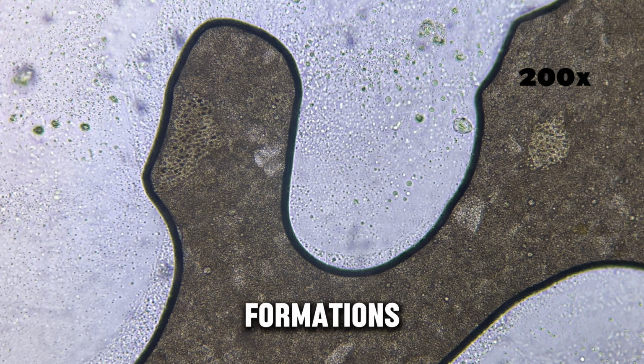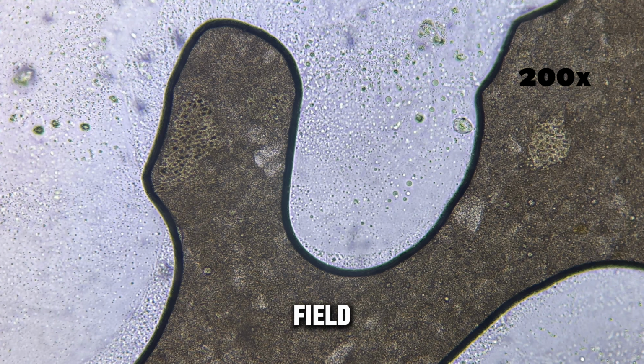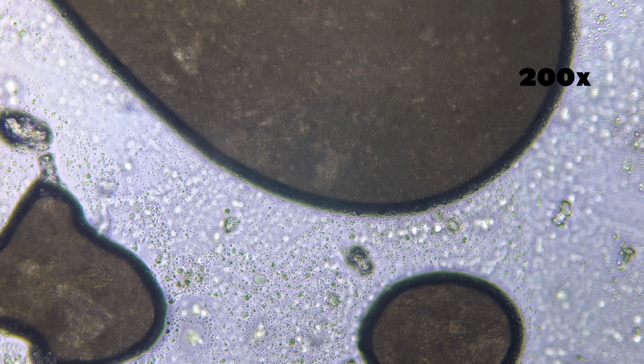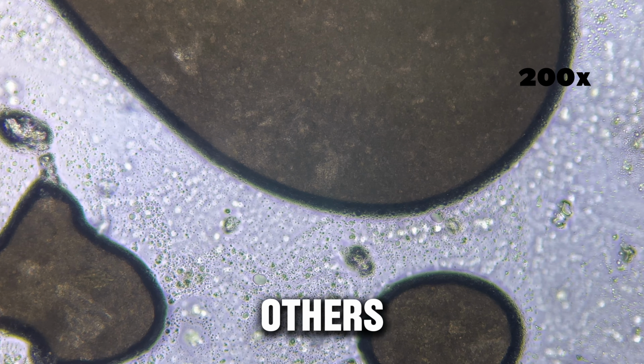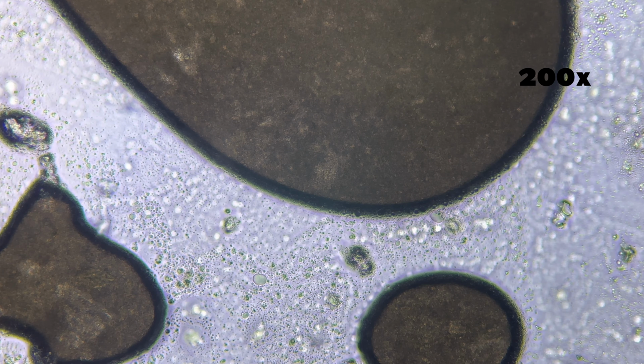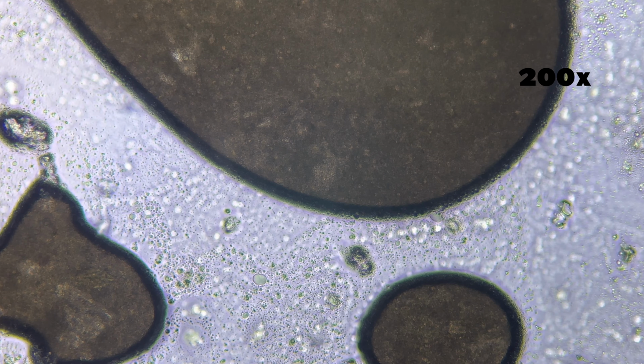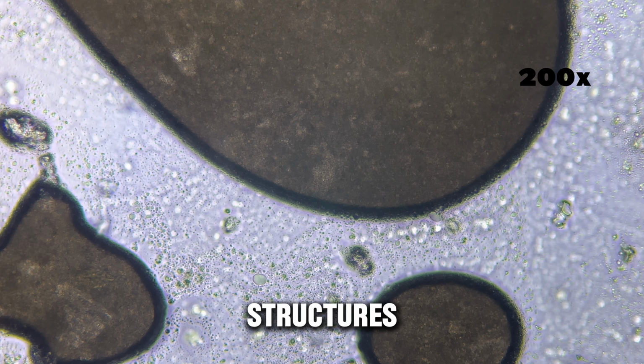Small rounded formations become clearly visible throughout the field of view. They vary in size and appear suspended within the surrounding material. Some cluster together while others remain isolated. Their uneven distribution adds depth and complexity to the image. The background looks finely granular. Countless tiny particles fill the space between larger structures.